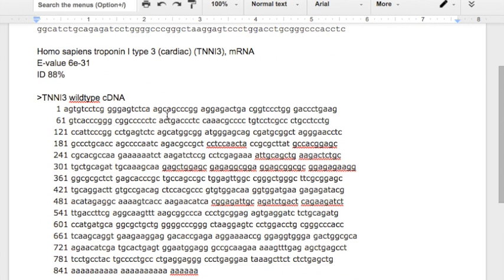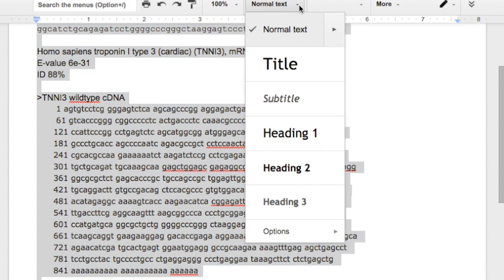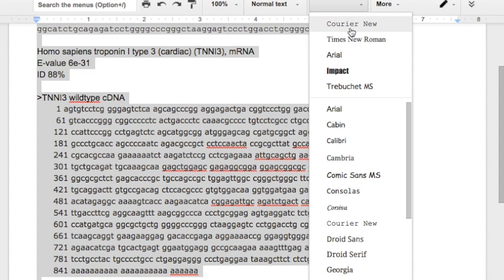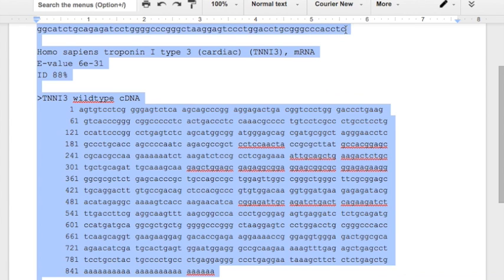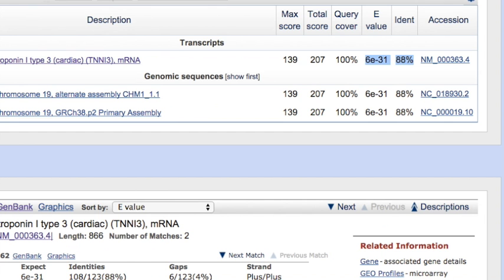And let's give it a name. So this will be TNNI3. And this will be the wild type nucleotide sequence. So I can just list it as cDNA. And there it is. One thing you'll want to do is generally keep everything in the same font. And that font is going to be courier because it equally spaces things out. This is an old typewriter font from ages and ages ago.